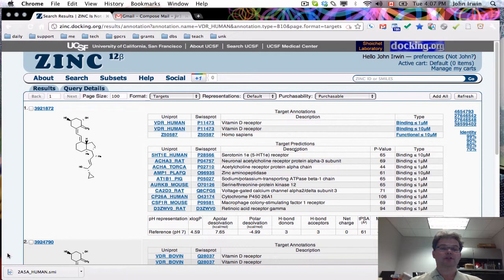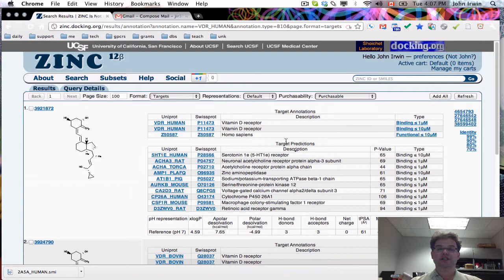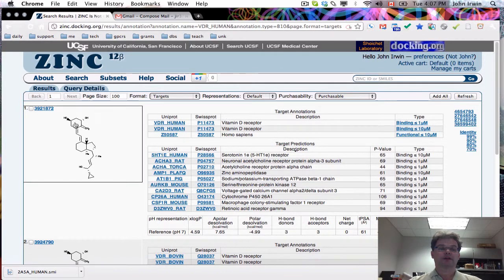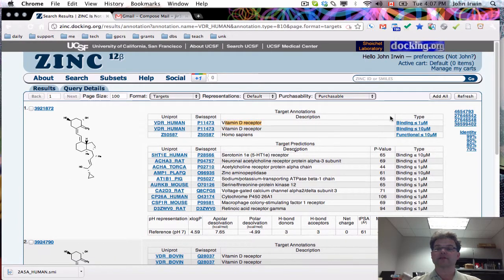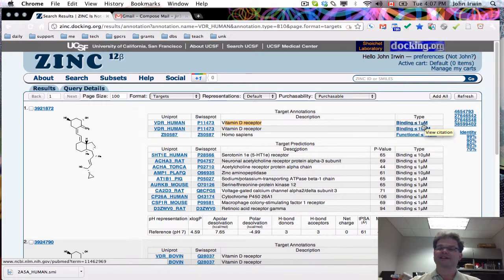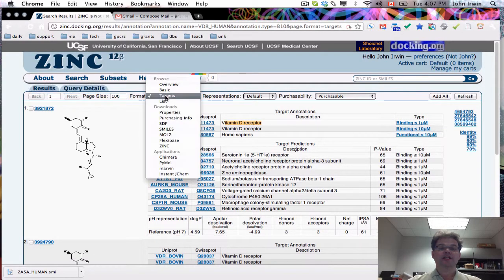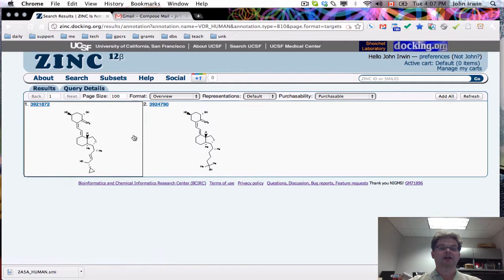Now it's showing you the target view of zinc. You can see the molecule, its annotations, and the predictions. Of course, you can only see those predictions if we authorize you to do that. That's not a default. These are annotated by default in ChEMBL as being active against the vitamin D receptor at both better than 10 and therefore also better than 1 micromolar. You can change the view to get an overview view and do a refresh.